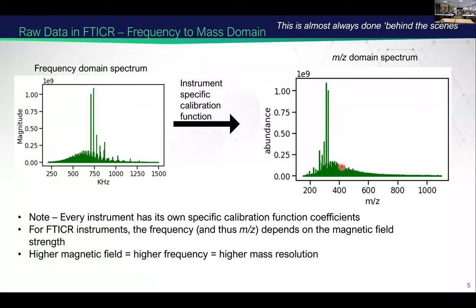So if you do LC-MS, you're only really looking at a very small fraction of the material that's present. You might be looking at things like metabolites. If you want to build up a picture of what is the changing metabolic profile of the sample, LC-MS is probably much more appropriate, because you get more quantitative responses from the upfront separation, and more structural insights from the fragmentation. But you're only seeing, for example, 1% of the diversity of species that you see with FTICR, wherein you get a much broader fingerprint of the chemistry that's present in the sample.